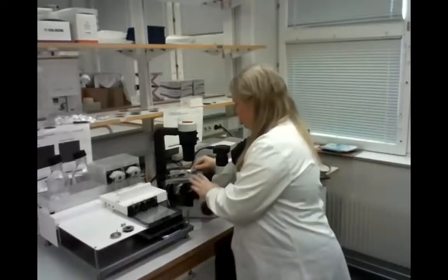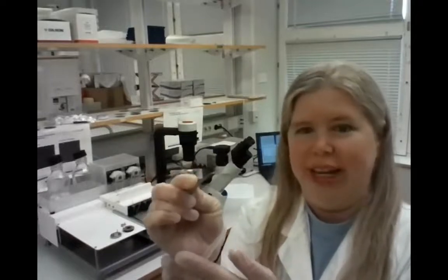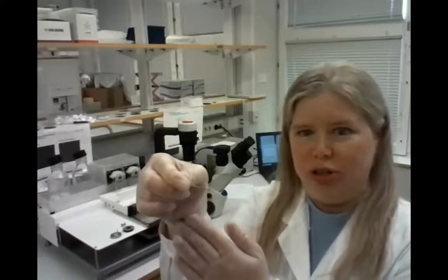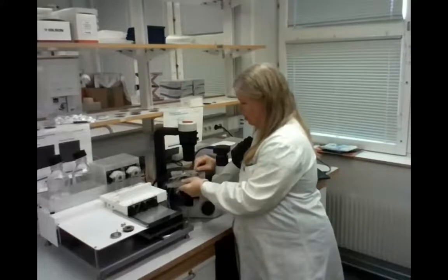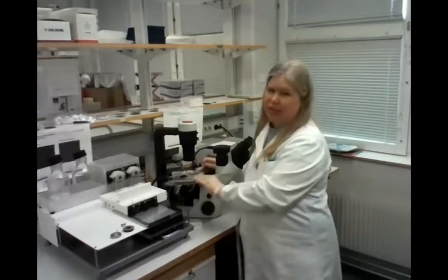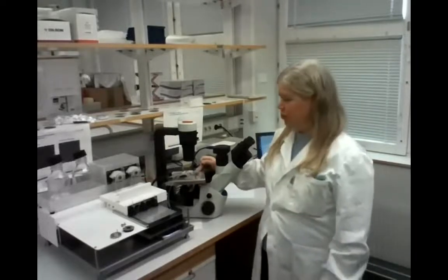What we start with is this glass cover slip that we have received from the holding chamber where the aerosol has been deposited, as Beatrice showed you within PreciseInhale. You take this glass cover slip with particles facing upwards, putting it in place on the dissolution assay. I know that it's hard to see, but I will explain more around it. And this dissolution assay is heated to 37 degrees to simulate the body temperature. So now we have the glass cover slip with the particles facing upwards.